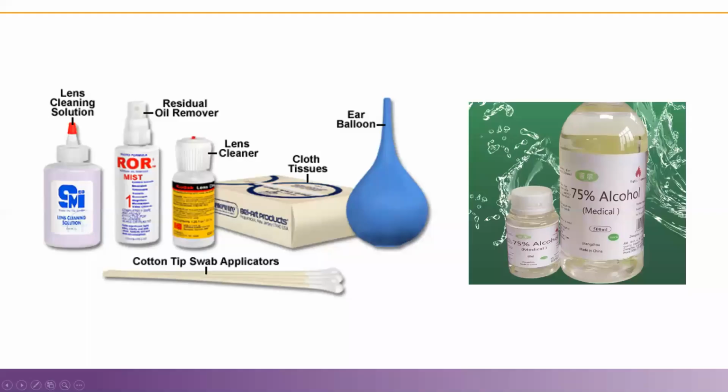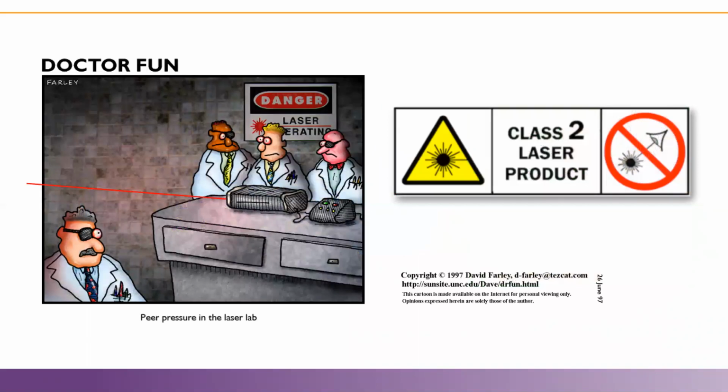Now, this instrument is very easy to maintain, so you don't have to worry about anything except the probe. Because you are using it endoscopically, there will be some blood clots on it. So we advise cleaning the probe once you have completed your imaging. Clean it with standard 75% alcohol so that it is also disinfected. You can also use lens cleaning solutions and any other microscope cleaning devices you have. And you don't have to worry about the biosafety of the laser because it's a class 2 laser, so it's completely biosafe. But don't stare at the laser for a long time.